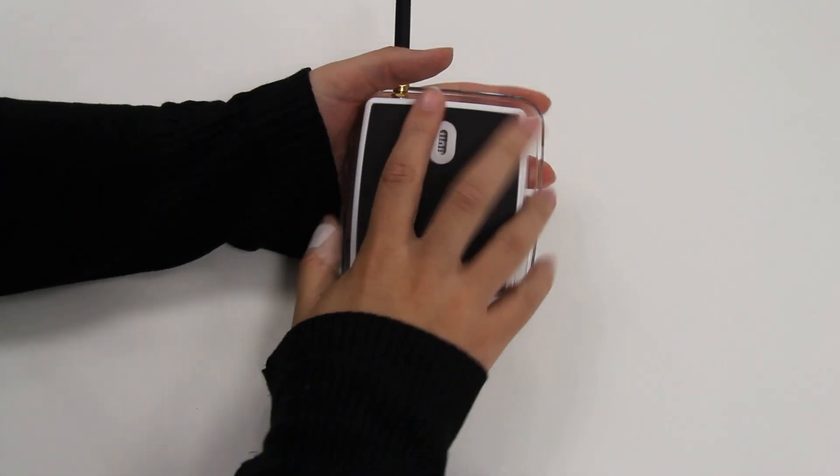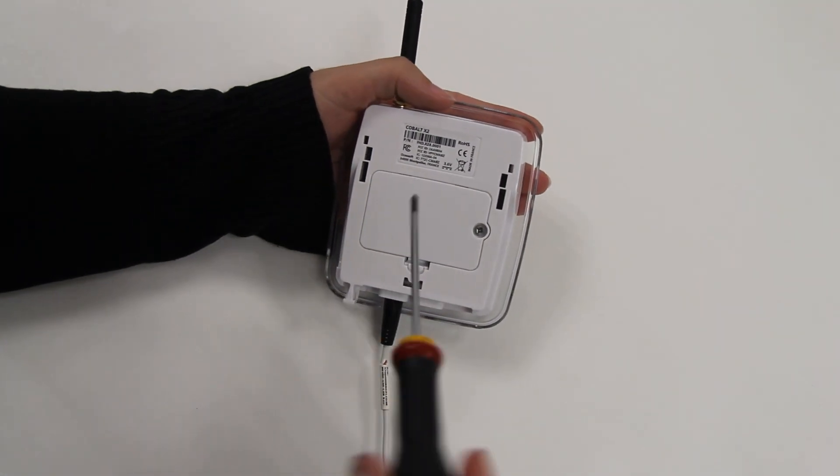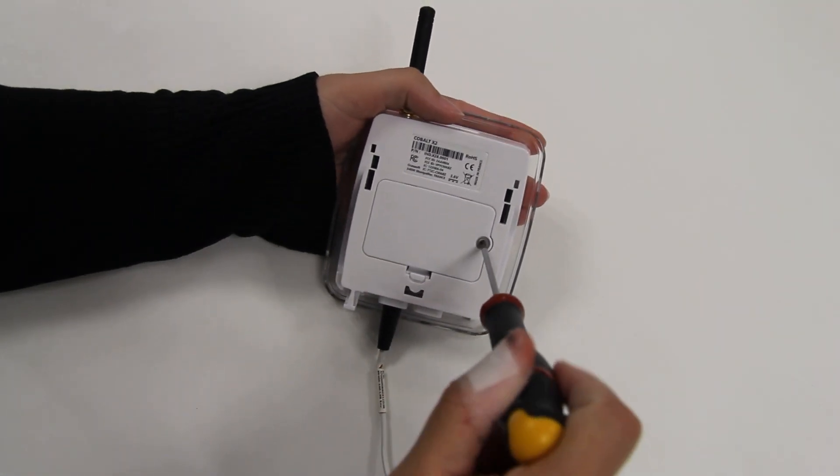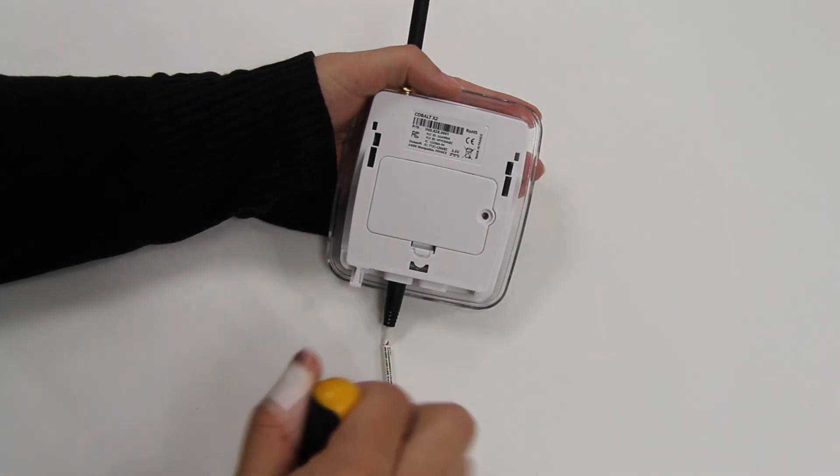The first step is to remove the cradle from the back of the data logger. Next, remove the screw on the battery cover. Remove the battery cover.